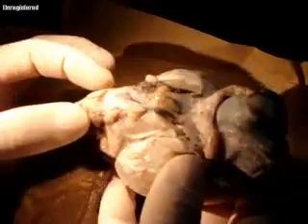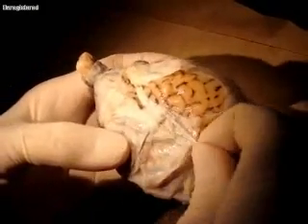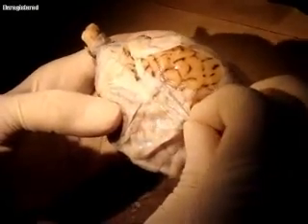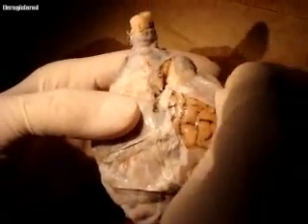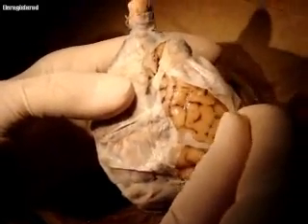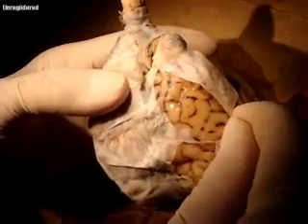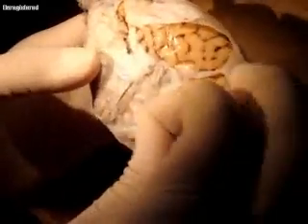The brain stem leading to the medulla oblongata in the very back. Okay? So you'll notice that on the outside of the brain, there's a really, really tough membrane. Do you see that? Kind of pull on it. That's the dura mater. The dura mater is one of the toughest of the coverings surrounding the brain. It's the outermost covering surrounding the brain, and the word dura mater means tough mother. So this is the tough mother.